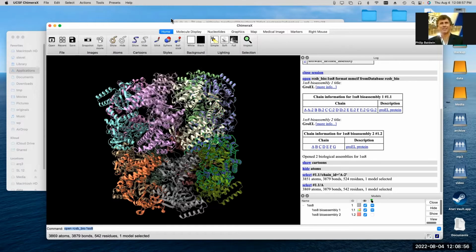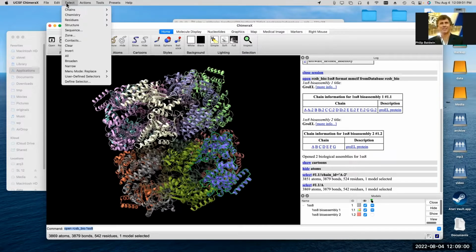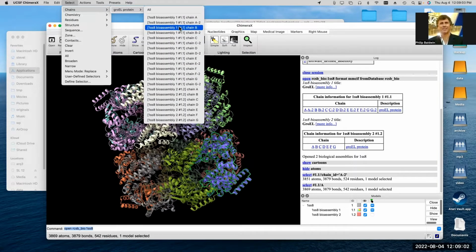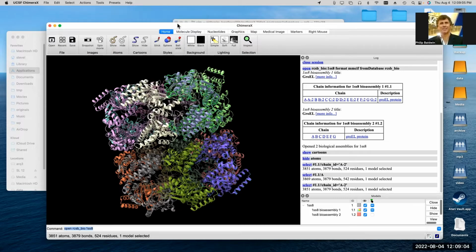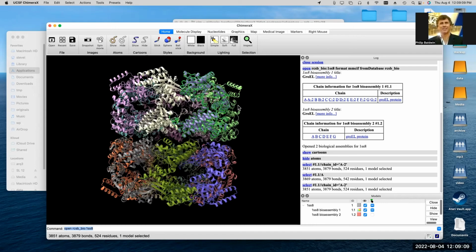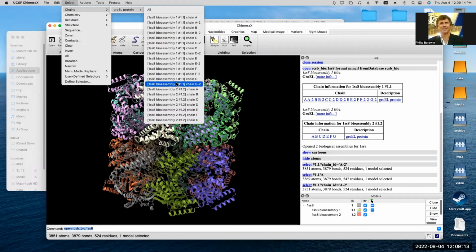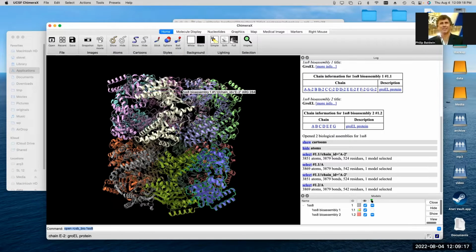All right, let me pick A. There's A, and let me pick A2. Okay, well, if that's the case, then what's this? A. I see.